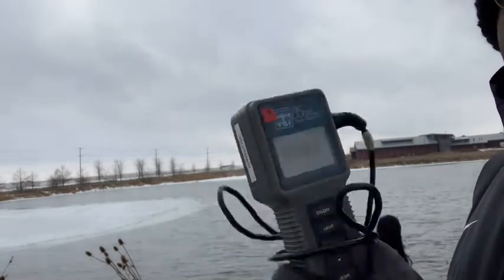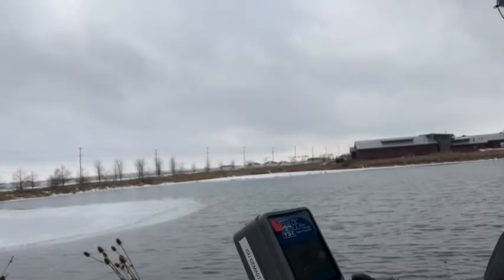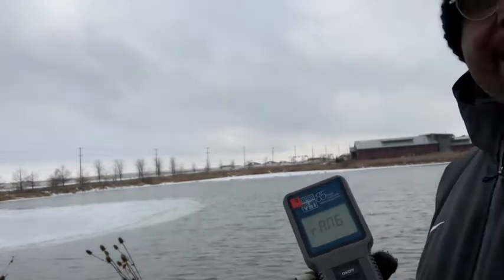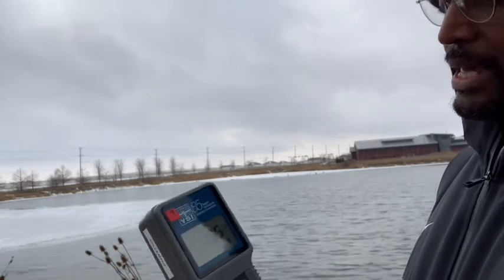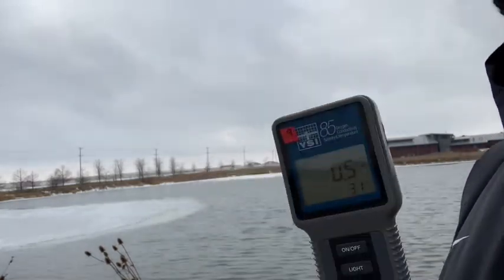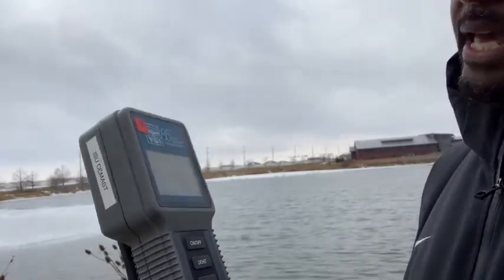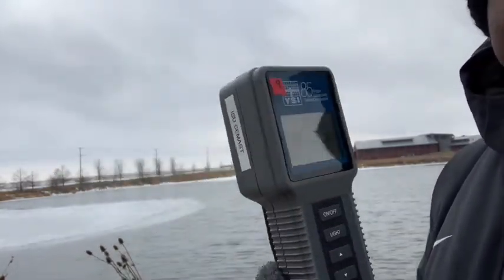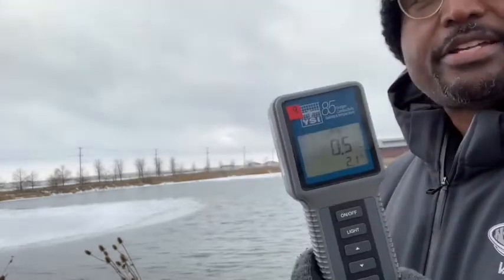And so to do my first measurement, I would press my mode button on here and bring up a screen that shows temperature. It's rather cold today. It's showing that right now it's 2.6 degrees Celsius, which is essentially the air temperature out here.